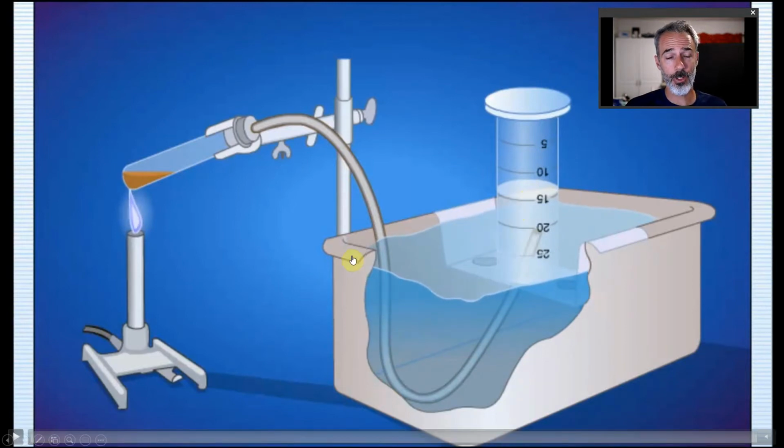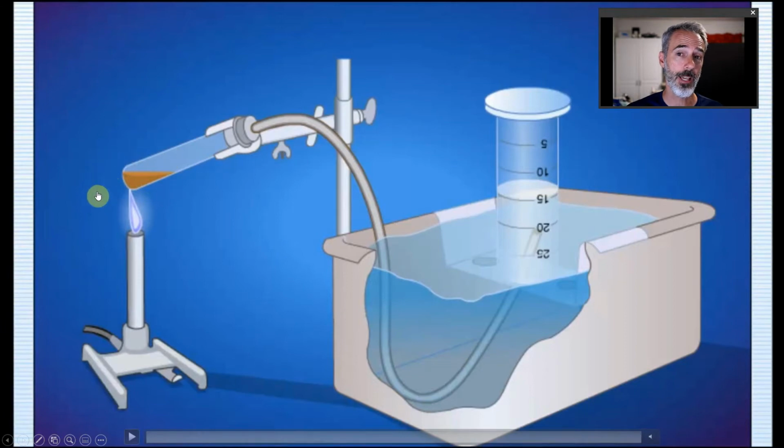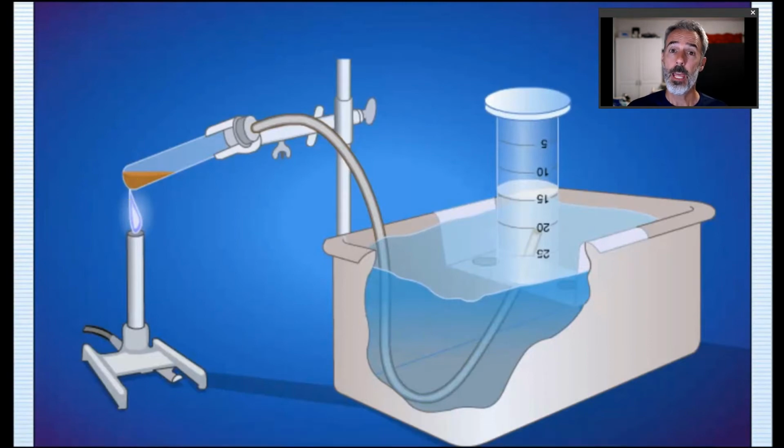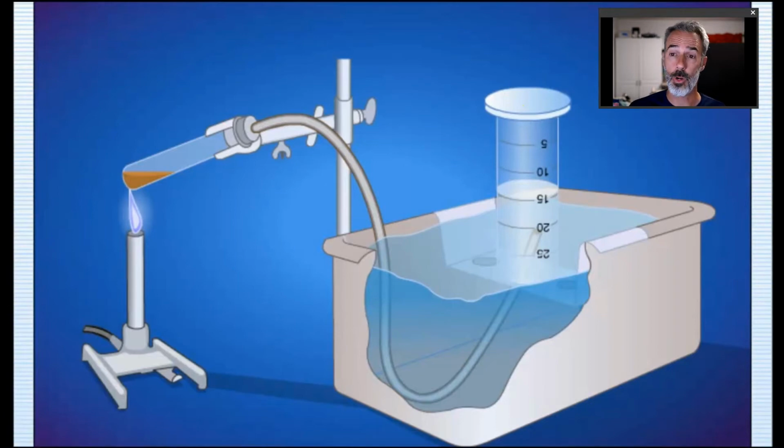All right, so if we're looking at this and we're thinking we're going to do some stoichiometry with it, a common thing to do in lab is to calculate the percent yield of the gas that you made. Well, the theoretical yield is easy, right? If I had kept track of how much potassium chlorate I had in the beginning, I could do a little stoichiometry and figure out how many moles of oxygen I would be expecting at the end. The actual yield, well, we're looking at this actual gas in this graduated cylinder, and it's pretty easy to record the volume of that gas. And you know where we're headed with this: if you can record the volume of this gas, the ideal gas law might be a great way to figure out how many moles of gas were actually made in lab, and then from there, percent yield is easy to calculate.